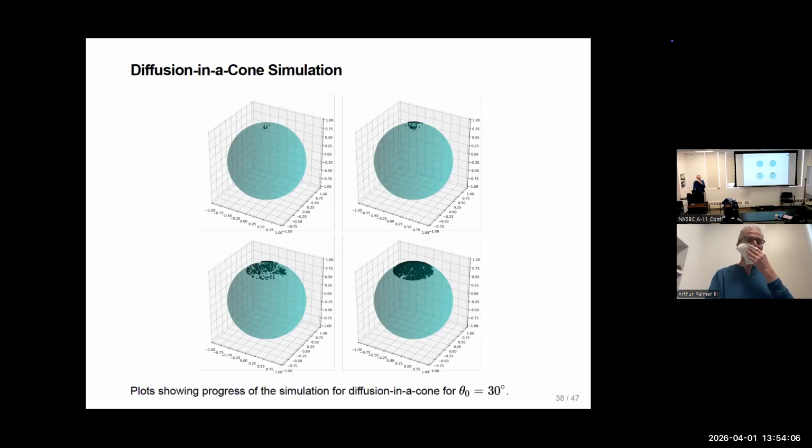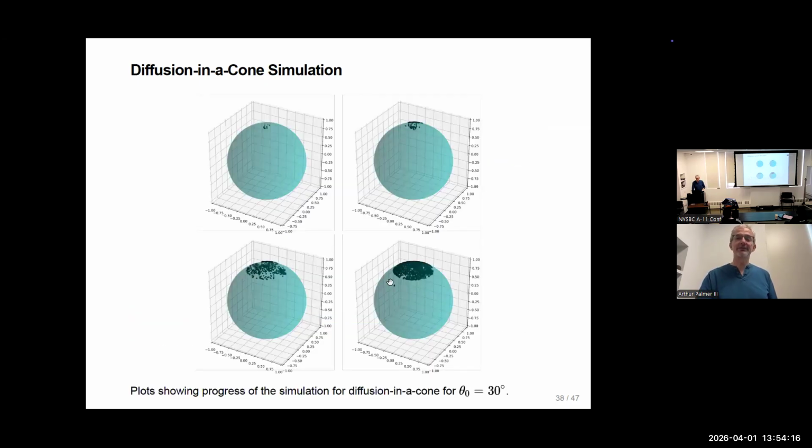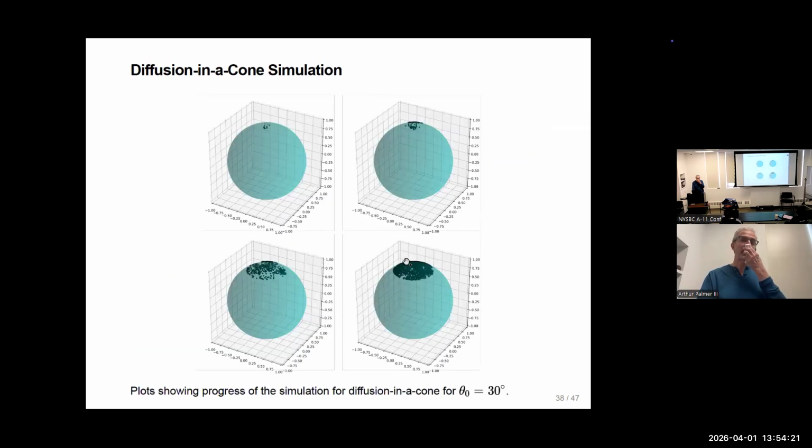Here's again a simulation showing diffusion within a cone. When you do that, as it's a diffusion, is it kind of flat, like you're filling the cone equally, or is it more the way that you're setting this up? To the best of my abilities, this was a random walk on the surface of the cone. It's not flattened, and it's not preferring the center. No.